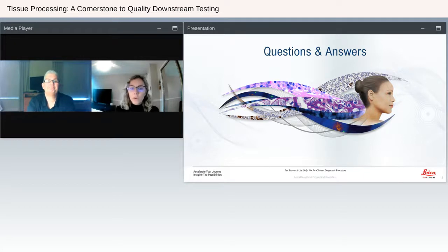Great. Okay, and we have one coming in from Alexandra. It says, how would you handle fresh tissues without PFA fixation for the embedding? I'm thinking maybe they're asking the question that if the tissue's fresh, you're doing cryotomy, maybe you're freezing it. So I'm not sure exactly. I don't think you can do fresh tissue in paraffin that I'm aware of. Okay. Maybe some clarification would help.